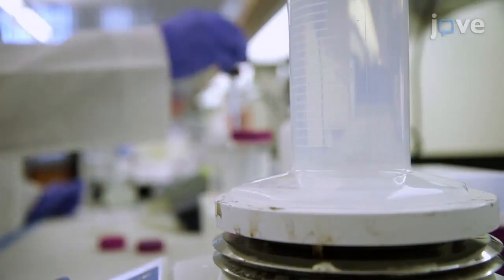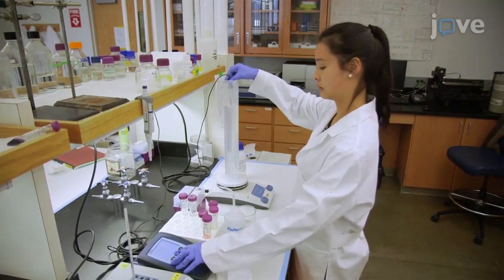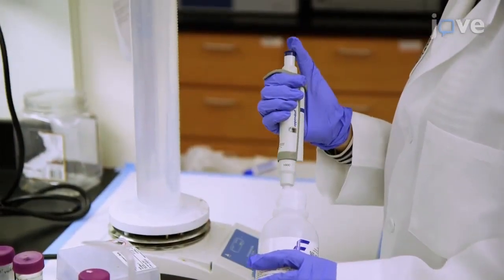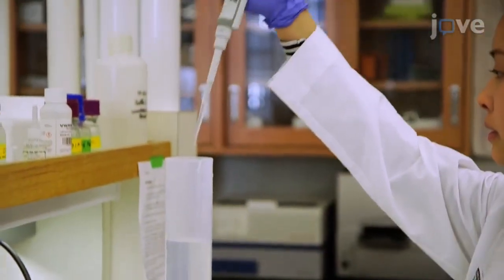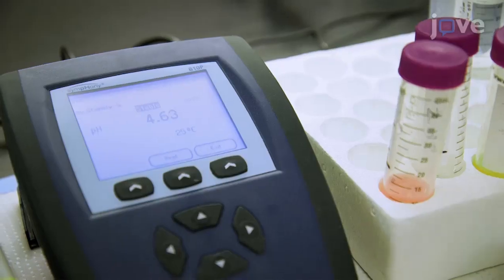When the anhydrous sodium acetate is completely dissolved, use a calibrated pH meter to measure the pH of the solution. Use a pipette to add 1 molar hydrochloric acid or sodium hydroxide accordingly to obtain the desired pH at 4.6.